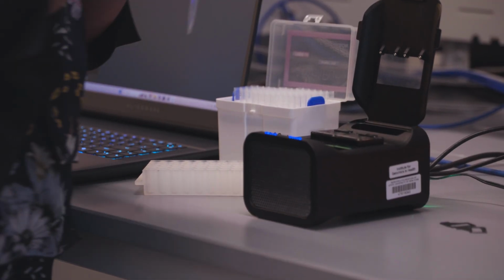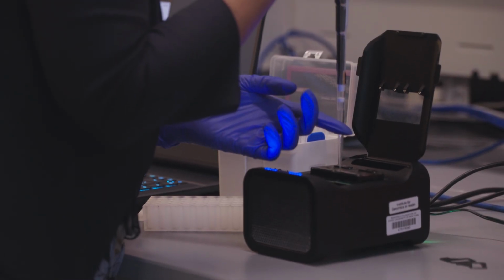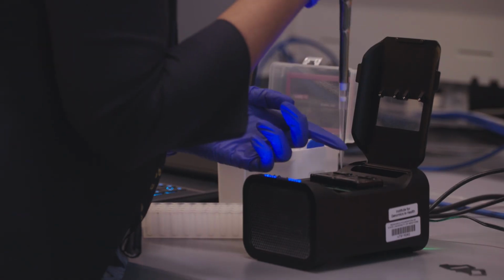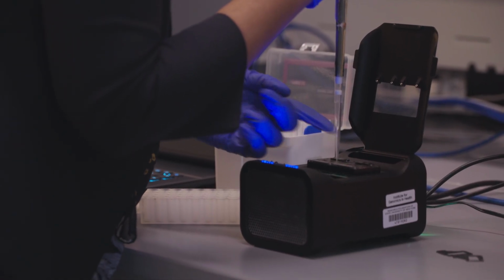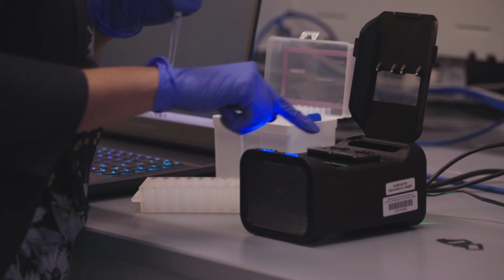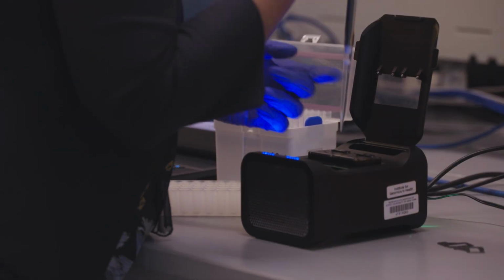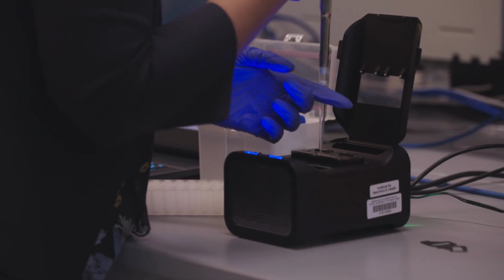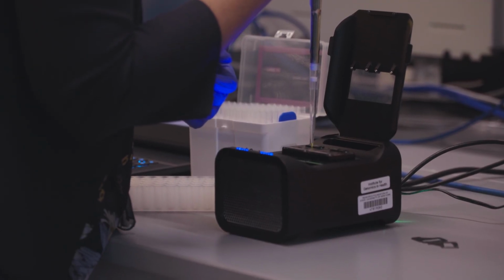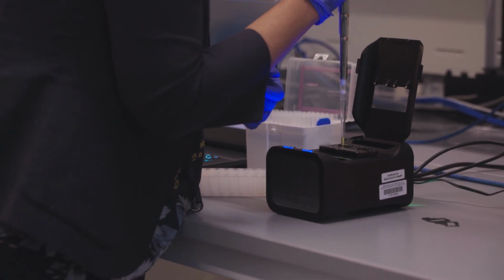Do the same thing. Once again, make it 200. So to clarify, you're not trying to remove all the buffer, you're just trying to remove the air bubble. For this one, yes. Only the air bubble. So you do it until you see an air bubble. Here you can see a small tiny air bubble, and that's the one we want to remove. Sometimes there is none, but it is good practice and recommended to just get rid of a few microliters.